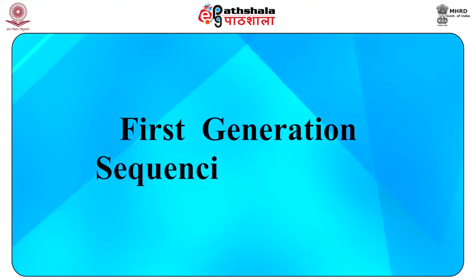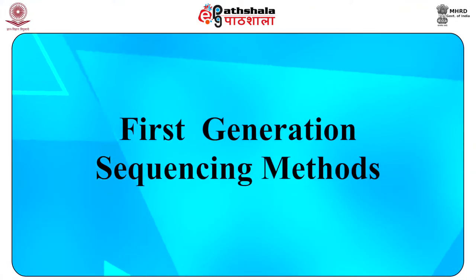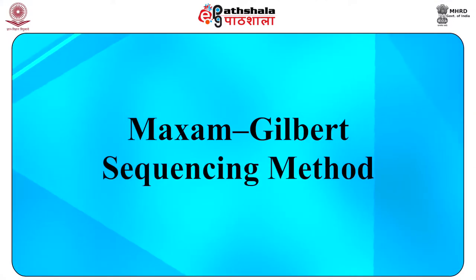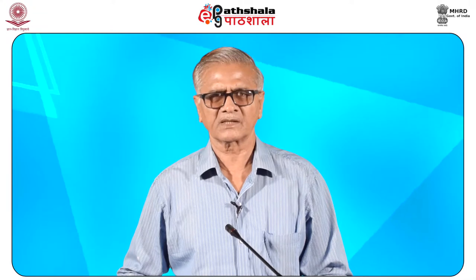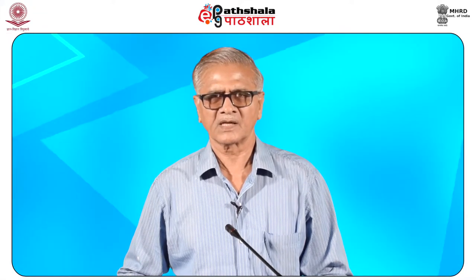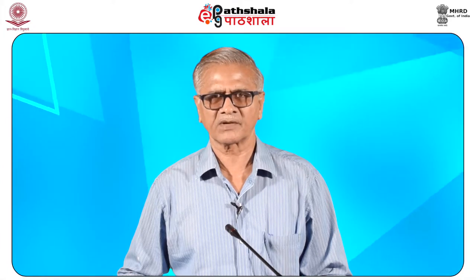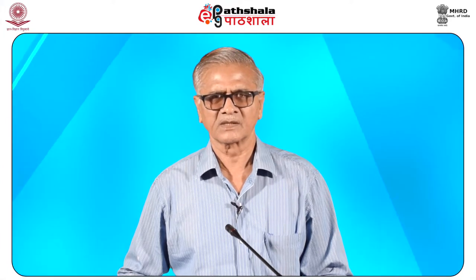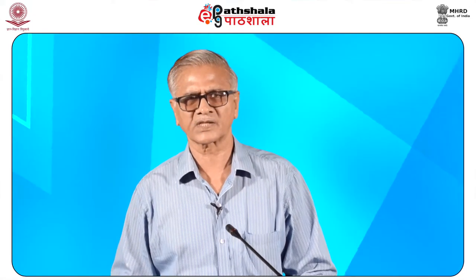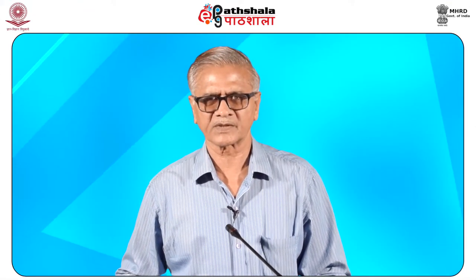Now we talk about first generation sequencing methods. In this, the first is Maxam-Gilbert sequencing method. In the year 1976 and 77, Alan Maxam and Walter Gilbert developed a DNA sequencing method based on chemical modification of DNA and subsequent cleavage at specific bases.